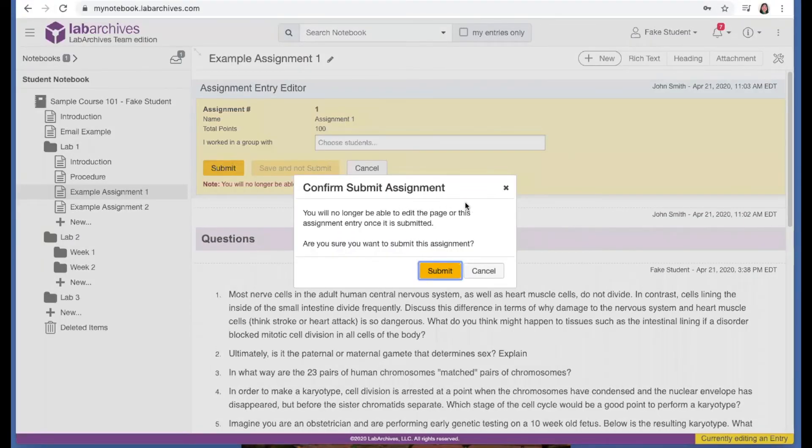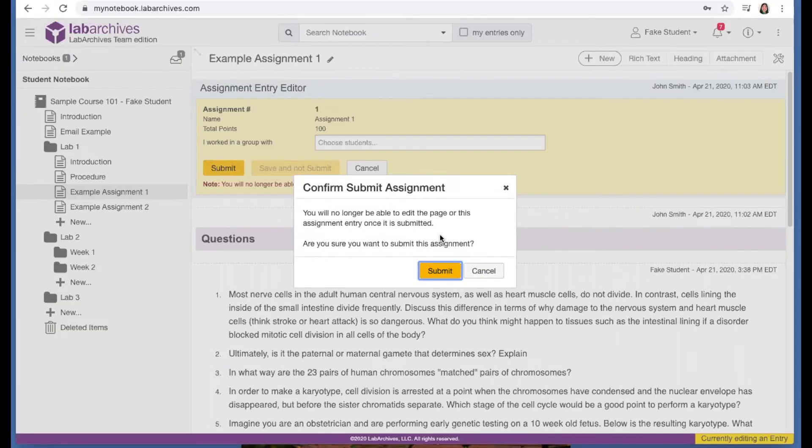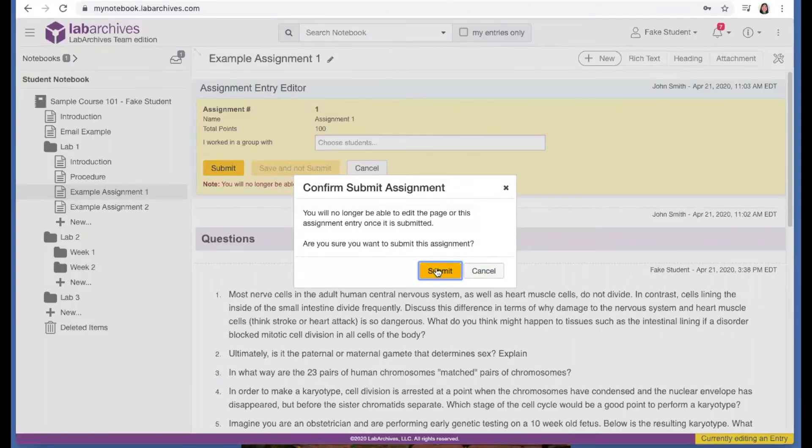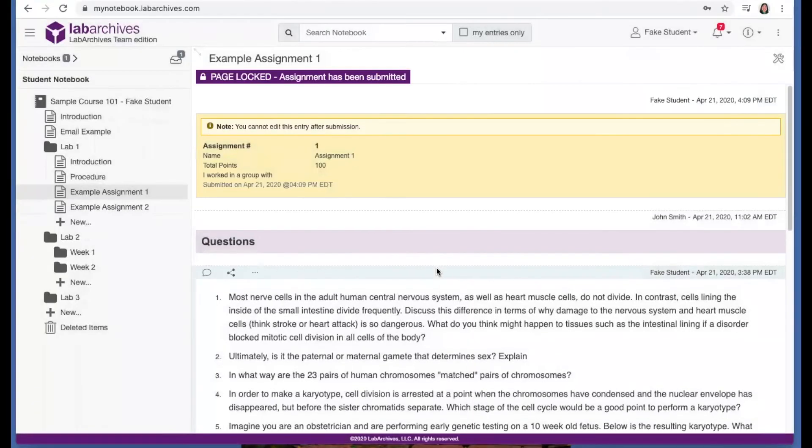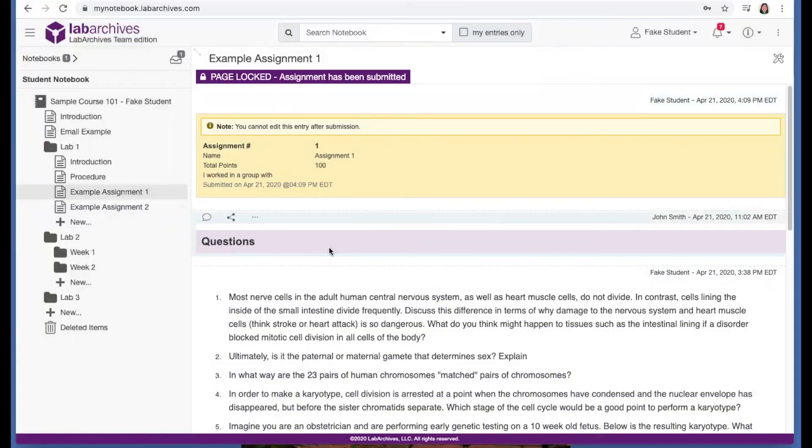After you click submit, you may see this message. This indicates that page locking is turned on for your course. After you submit this assignment, the page will lock, and you will not be able to make any changes to the page until your instructor unlocks the page for you.